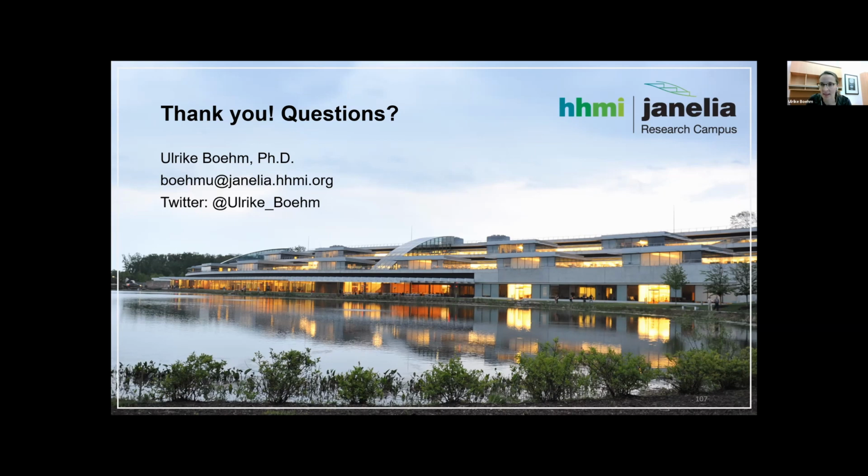So there you again need to have lots of checks and balances in place to make sure that you do not treat the sample too harshly. That's why you also have to do the scanning and maybe even the milling quite slowly. But at the same time, these systems, I think, initially weren't necessarily designed to operate over a long amount of time with a very stable performance.